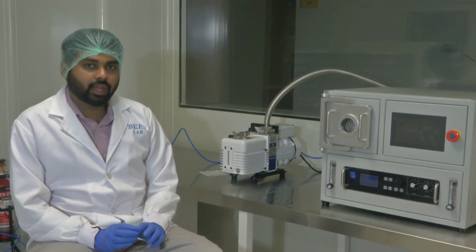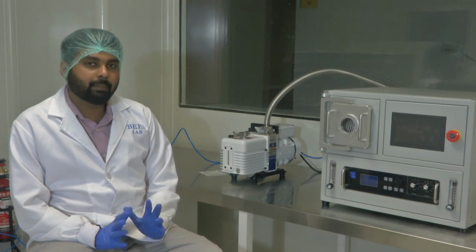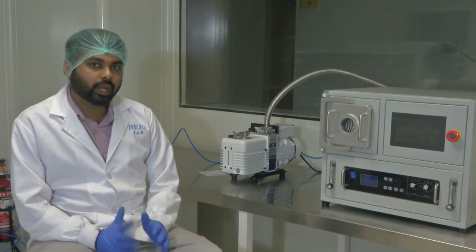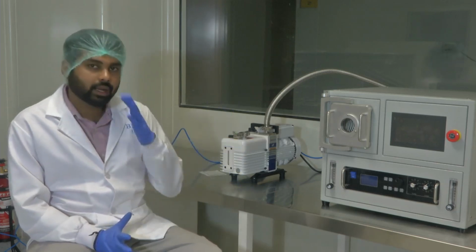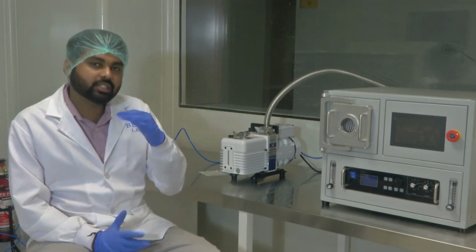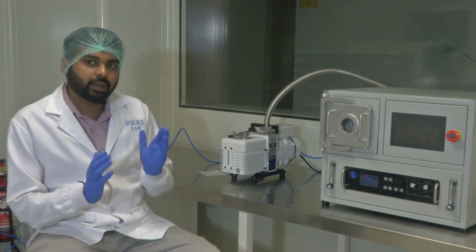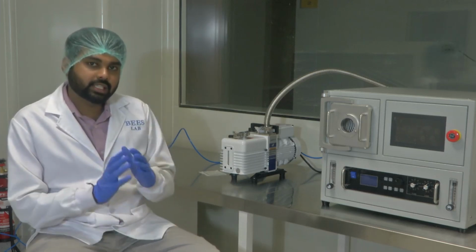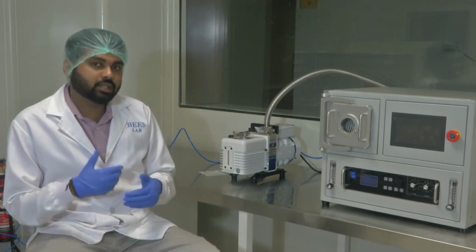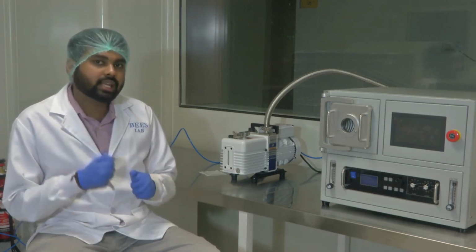After this, we have to apply RF power. RF power is basically applying an electric potential in the gaseous mixture through a radio frequency coil. There is a coil around the chamber. The chamber itself is made of quartz glass, and there is a coil outside the quartz glass that supplies voltage into the gaseous mixture. This is RF energy transmission. It's like a wireless energy transmission to the oxygen species, and it starts becoming plasma.